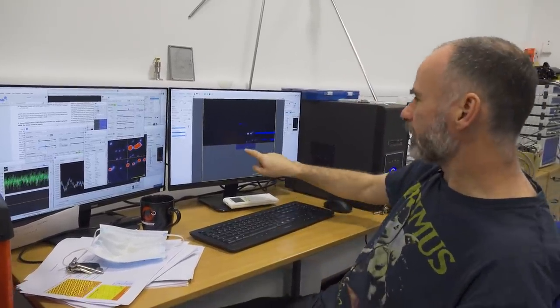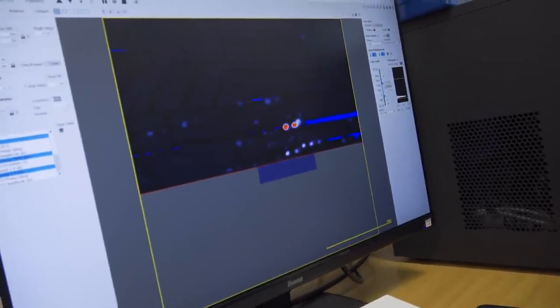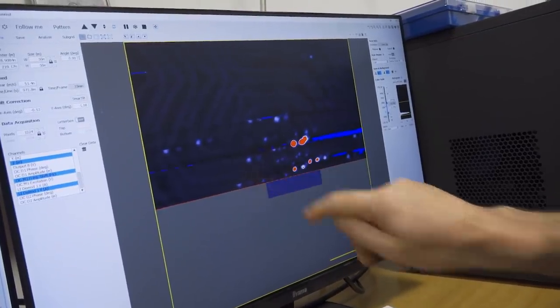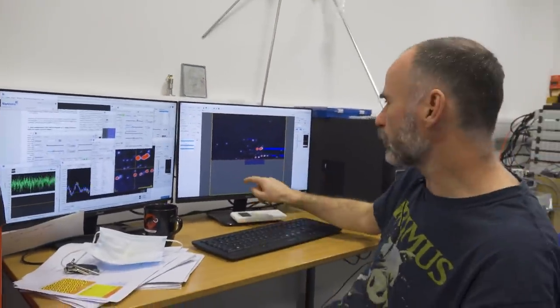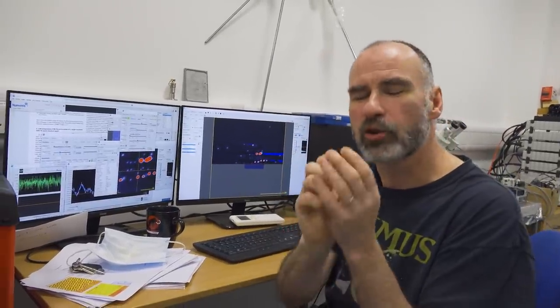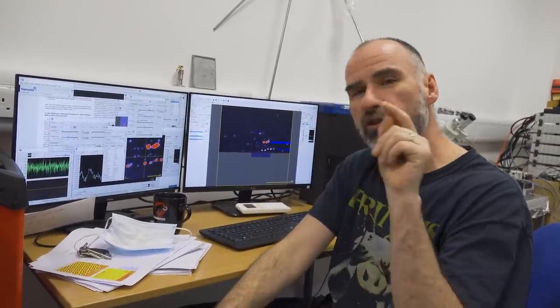However, what happens is that, yes, on occasion, and let me change the contrast here, we can indeed put down single atoms, these little features. But also, the problem is, sometimes when we do exactly the same process, larger clusters appear. So we have some degree of control, but not a great degree of control over just how many gold atoms we put down. But the good thing is that there's a reasonably high probability of putting down single gold atoms. And then what we want to do is try and shunt those across the surface.